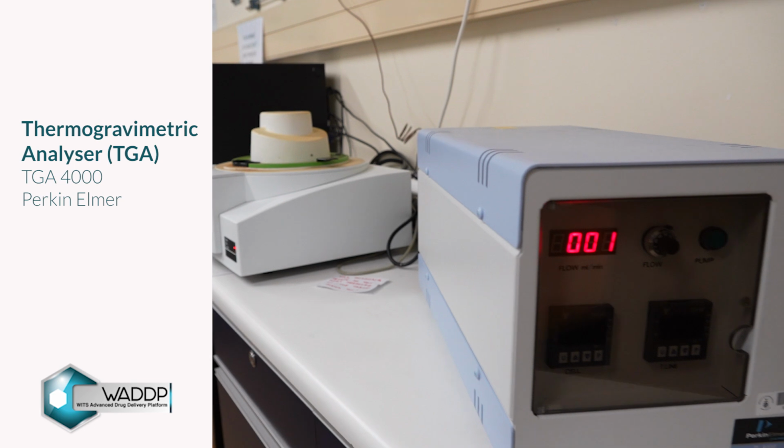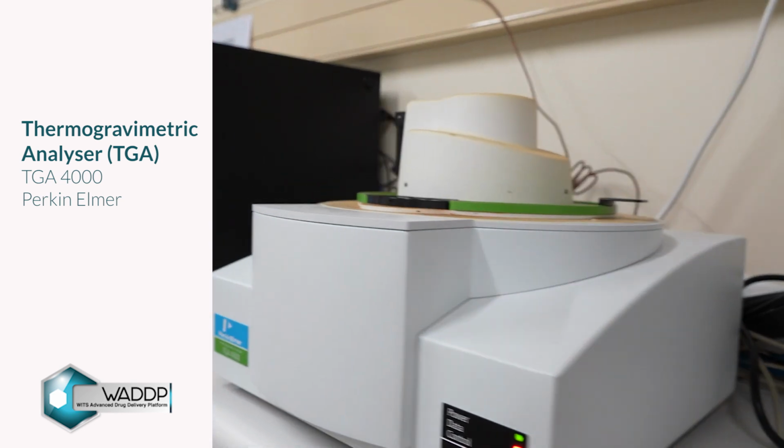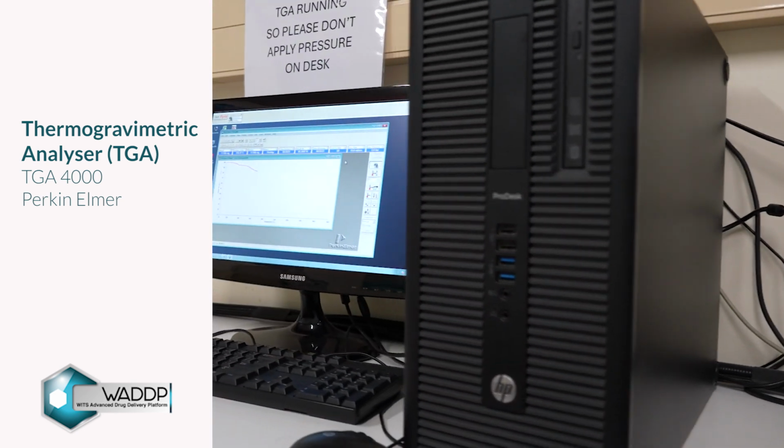Thermogravimetric analyzer measures mass changes in a sample over time as the temperature is varied or held constant in a controlled atmosphere.